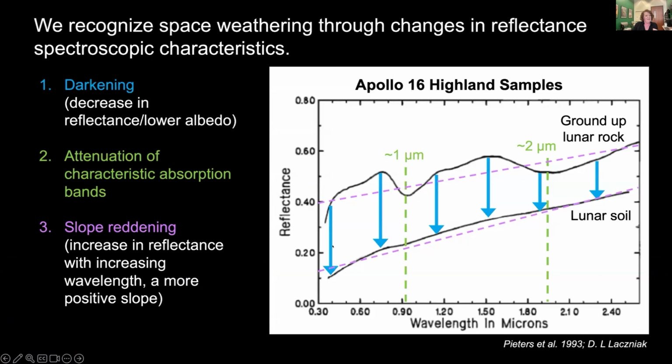They looked at lunar soil, so just a scoop sample that the astronauts picked up on the surface of the moon, and compared their visible to near-infrared reflectance characteristics to a rock that they had picked up on the moon and then crushed up in the laboratory here on Earth to create an artificial soil. And they noticed there were three significant differences in the spectral characteristics between those samples.